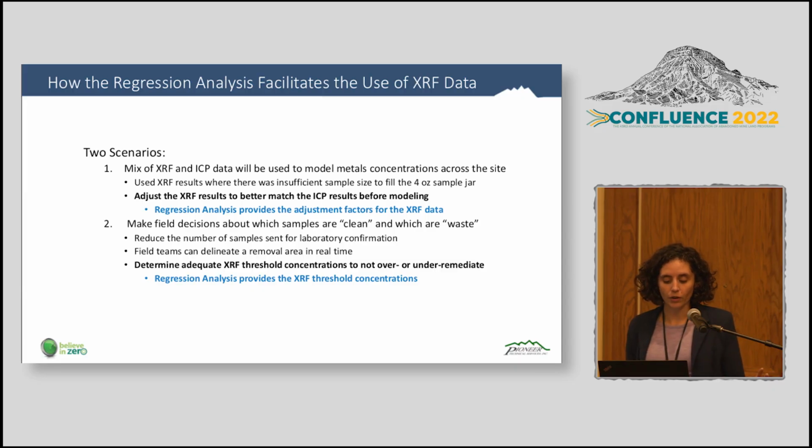So the purpose of the regression analysis is to adjust the XRF results to better match the ICP results before modeling. For the second scenario, we want to make field decisions about which samples are clean and which samples are waste. We can reduce the number of samples sent for laboratory analysis, which can reduce costs for the project. And then field teams can delineate a removal area in real time.